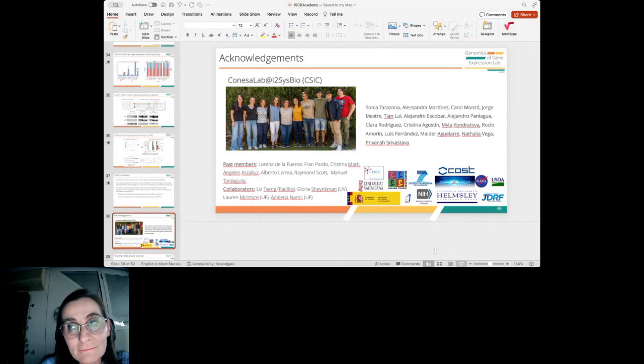Remember, we had 4 different ones, and we can see differences in the ability to capture either the 3' or the 5' end. There is also a contribution of the degradation of the RNA, so if you have degraded RNA, you will have a lot of incomplete matches that are just degradation products, and it's tricky to differentiate that.